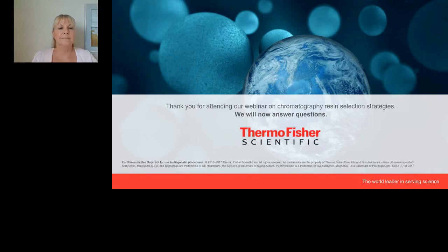Great, thank you. The next question is for Aaron. You've talked about using poros in packed chromatography columns for an LC. Can poros be used in gravity flow or spin column?